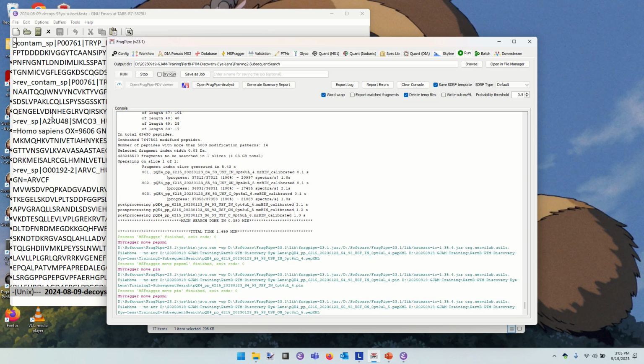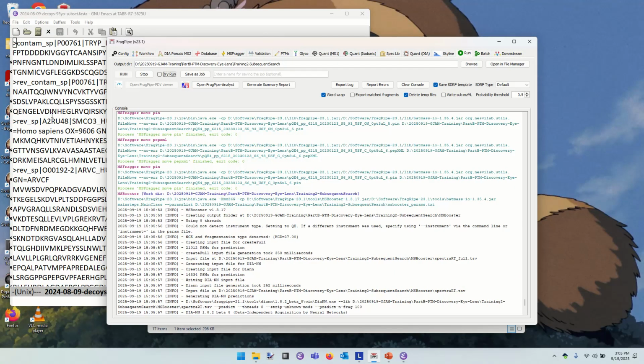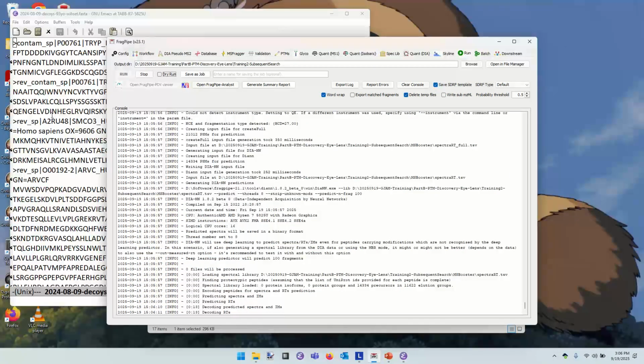It means that there are some peptide sequences that have so many modifiable locations that there are more than 5,000 possible ways to decorate that one sequence. It's pretty extreme, isn't it? So that's a good way to gauge just how badly things are going for the explosion of your search space as you add PTMs.